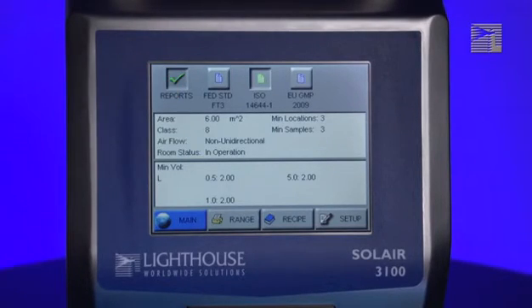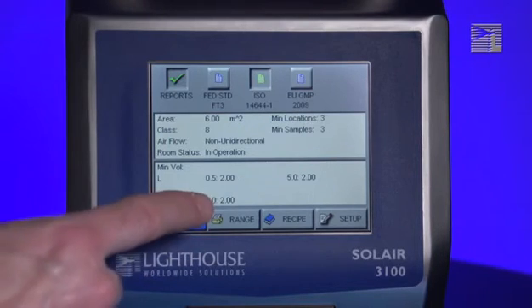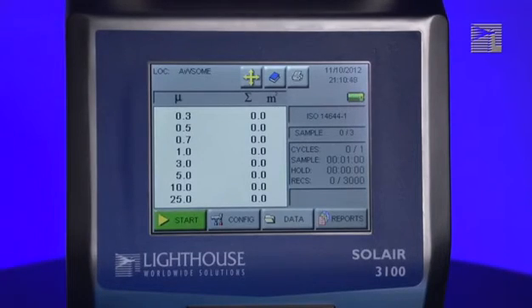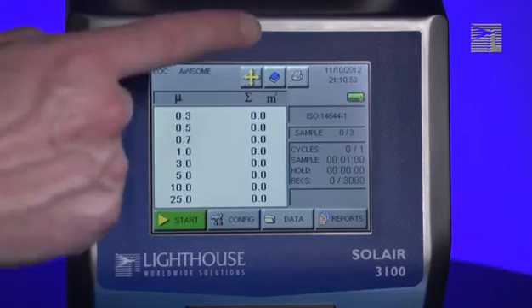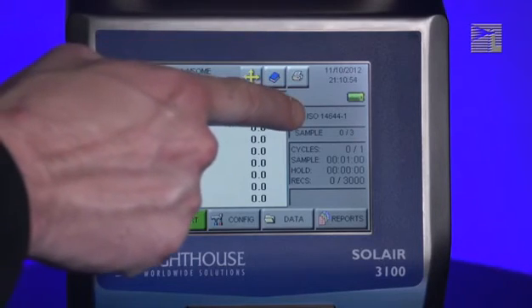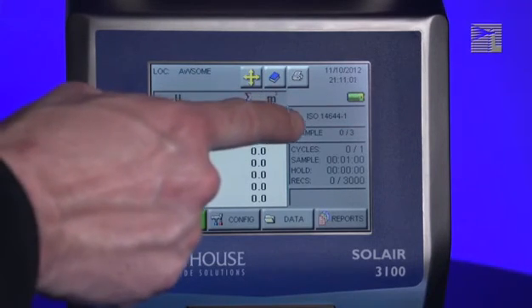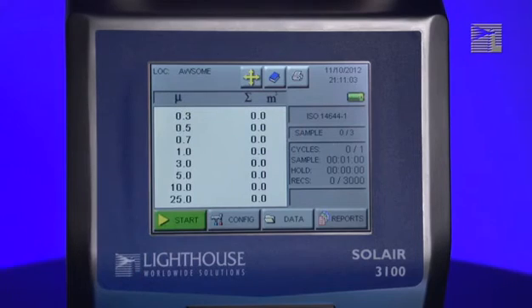After you have enabled the reports, press the Main button to return to the main screen. Notice that when reports are enabled, the main screen no longer shows temperature and humidity. Instead, the box below the time and date displays the name of the report being run. Below the report name, the instrument displays the number of samples that have been taken and the number of samples required to complete the report.